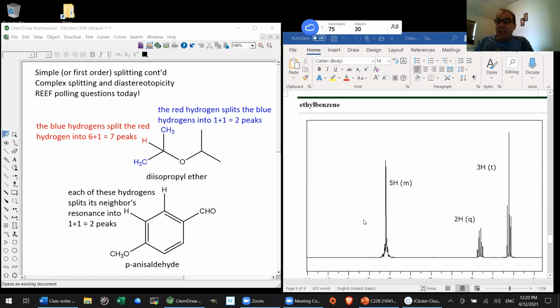And this is one of the reasons that even though you would predict 2 or more sets of hydrogens would show up in different places, they're so similar that you can't tell them apart. And so they just fall on top of one another. And the way you can know that is largely from integrations. So you're not really going to get 5 hydrogens that are exactly identical. They're just all very similar. And so they all fall on top of one another. And in alkyl benzenes, it's not the only case, but that's an especially common case of that.